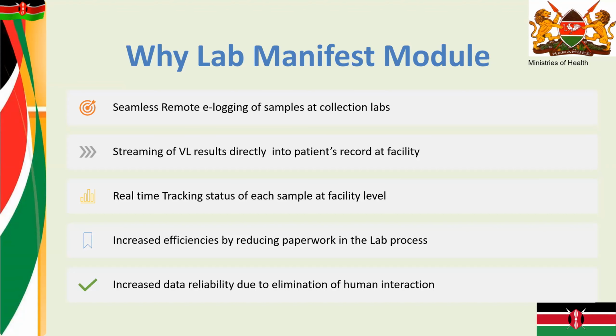So if you look at it, the module eliminates human interaction between the point of sending the manifest or logging the samples and receiving the results. We eliminate the human interaction in terms of manually entering the viral load results, which sometimes would lead to typographical errors.